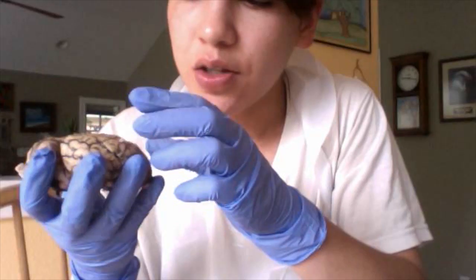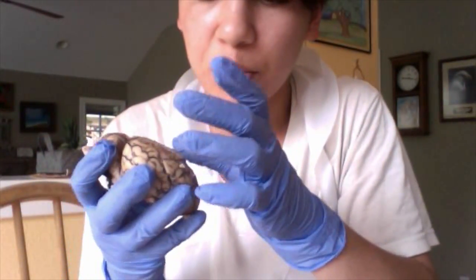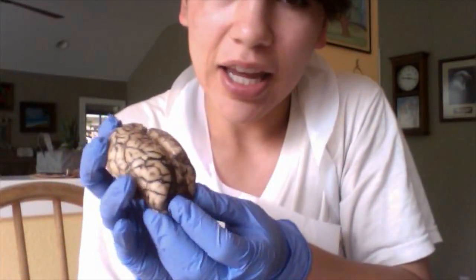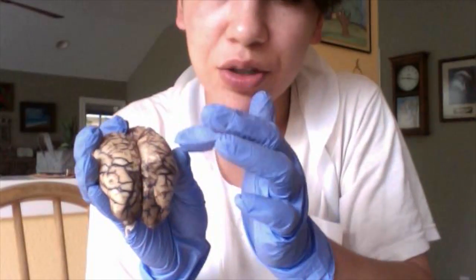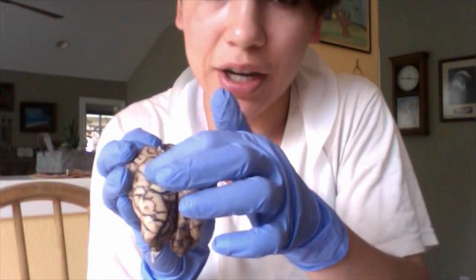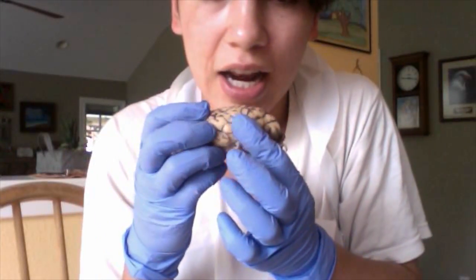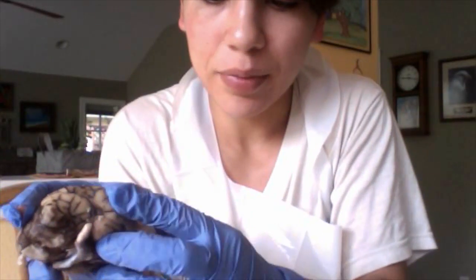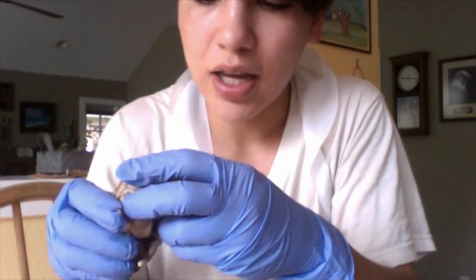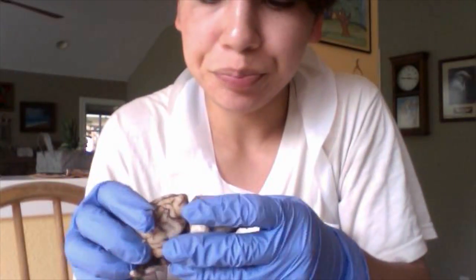So I have already split this brain along the longitudinal fissure, but we will start with it as a whole. At the anterior end of the brain, I have the frontal lobe. On the left and right lateral sides, I have the parietal lobe here and here. Inferior to that, I have the temporal lobe here, as well as on this side. And at the posterior end, I have the occipital lobe here and here, and this is the cerebellum.